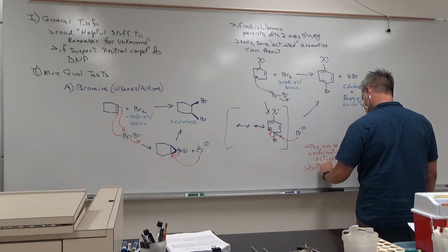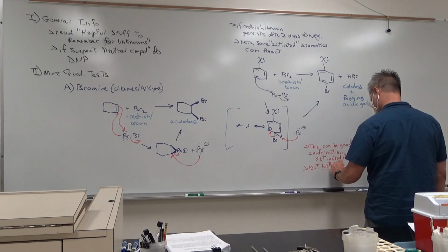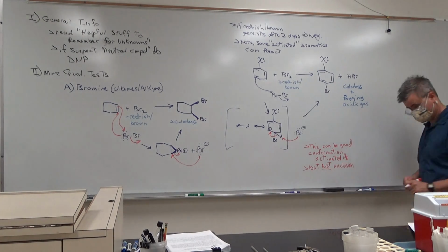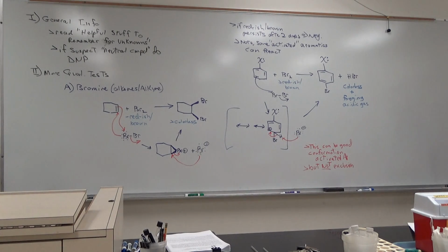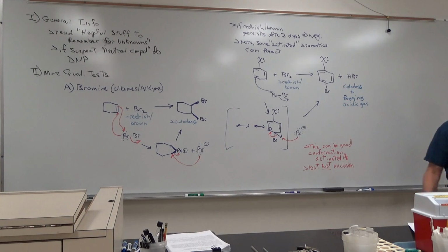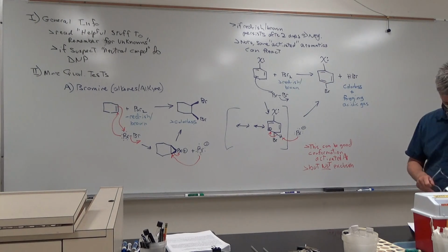But not good exclusion. So if you don't get a positive test, that doesn't mean you can exclude the possibility that you have an activated aromatic. It just might not happen every now and then. Okay? That's why I tend to call this more of a false positive that gives you good information sometimes.